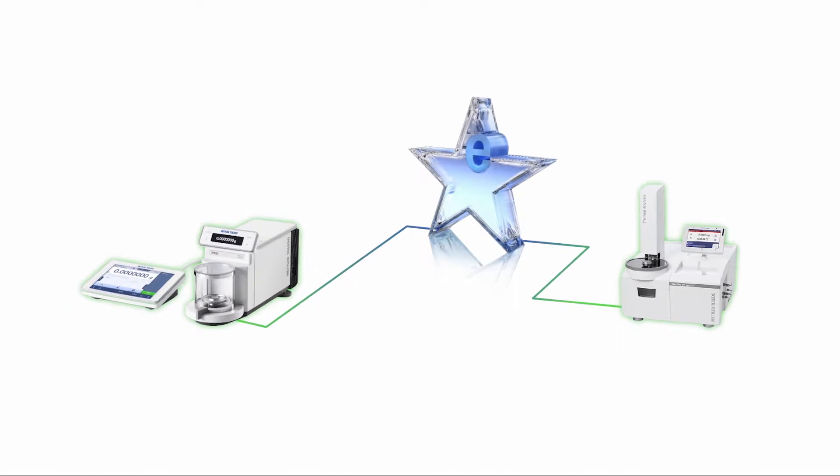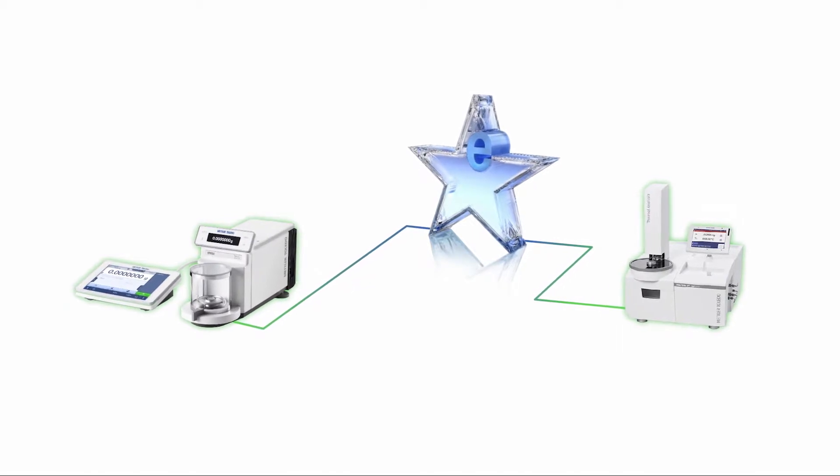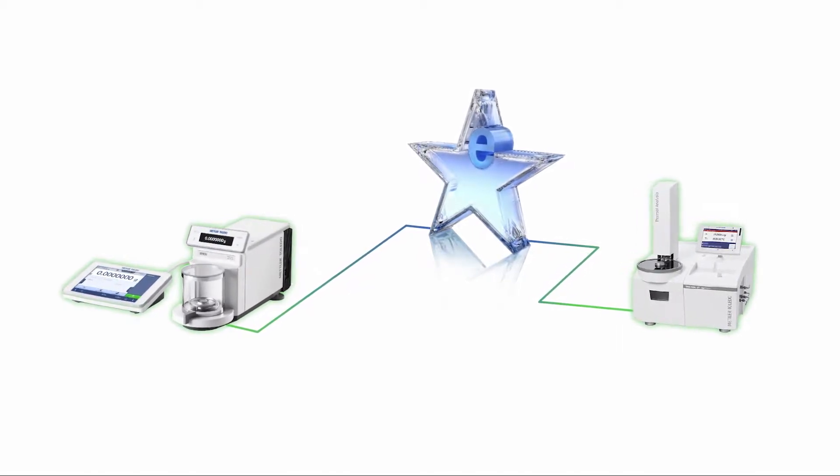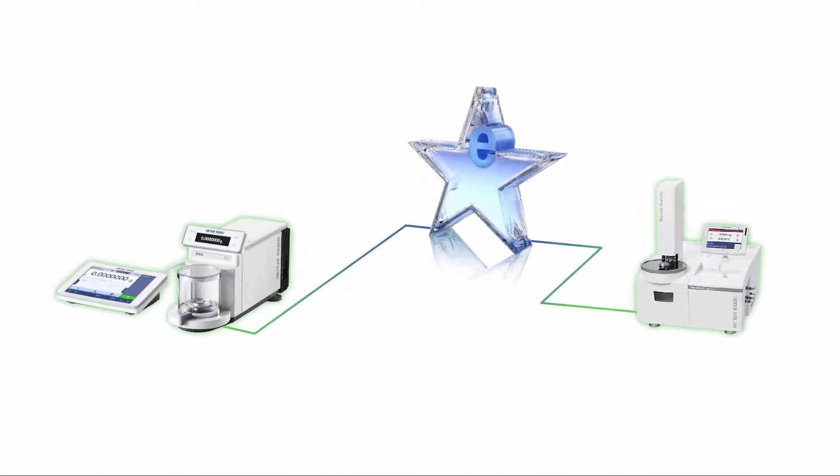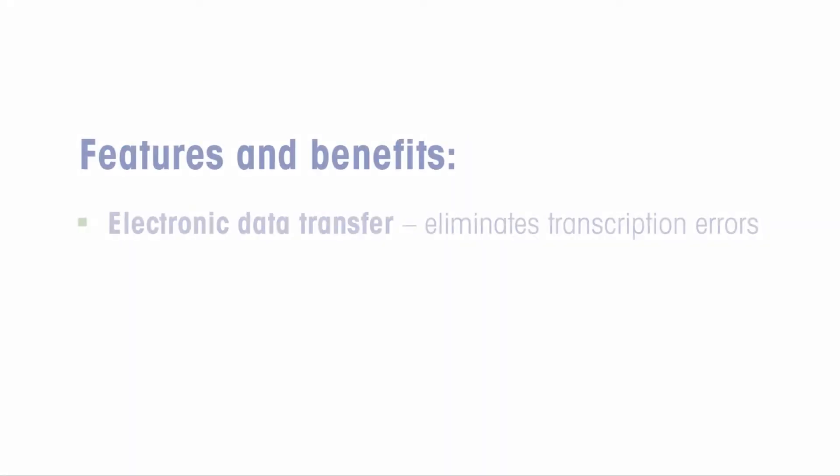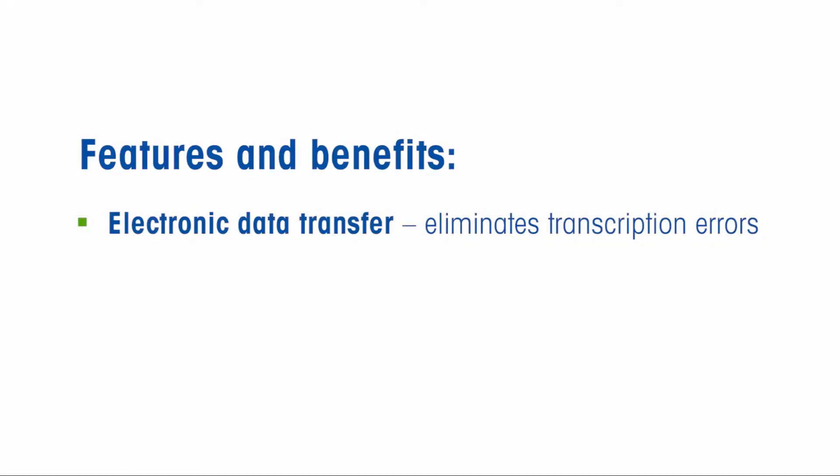Interfacing an external balance with STAR-E thermal analysis software permits electronic transfer of TGA sample weights for seamless and secure thermal analysis workflows. Electronic transfer of weighing results from an external balance to STAR-E eliminates transcription errors.